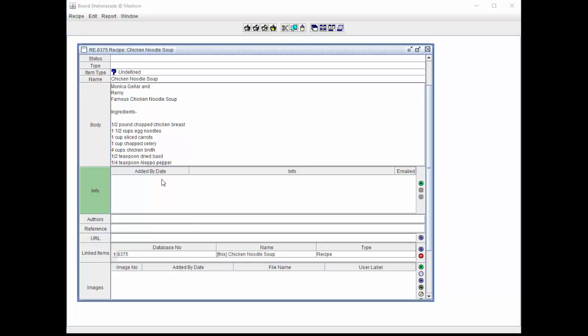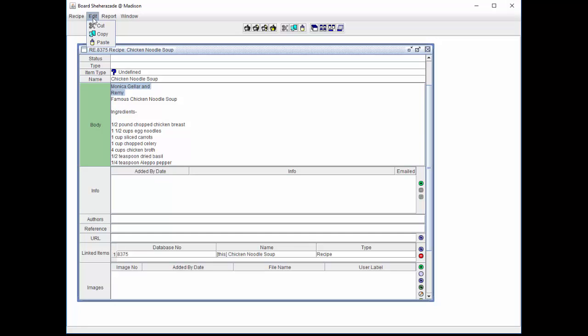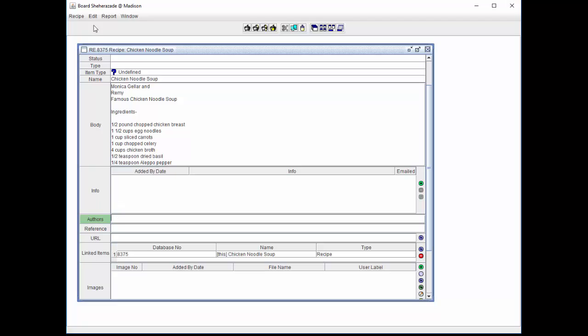The authors and reference fields below can also be edited by clicking in the field and either typing in the data like we did in the body field or copying and pasting information from another field. This can be done by selecting the data from another field, highlighting it, and selecting edit from the menu bar and copy. Click in the text field of the authors field and select edit from the menu bar and paste.